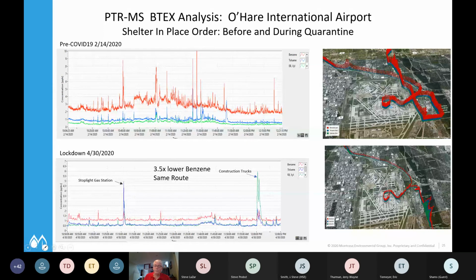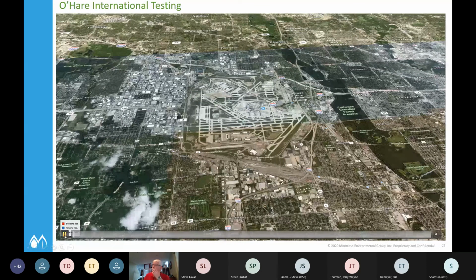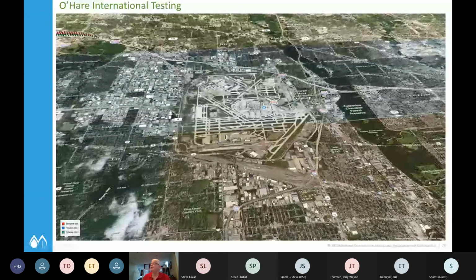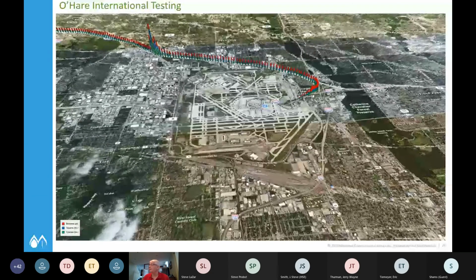just to give you an idea of what this actually looks like when we're... It's supposed to be, there we go. This is the same map. Now this is a BTEX continuous map, and you'll see here that these peaks are a little bit, there's a little bit more data here than what we looked at with the ethylene oxide.